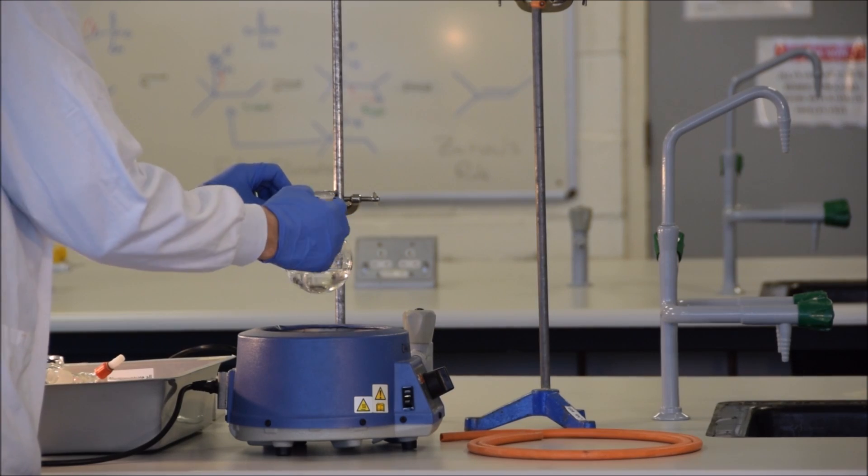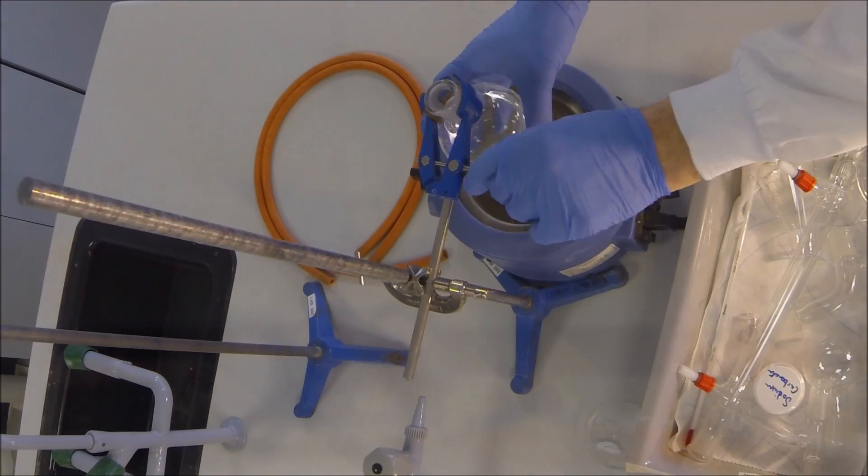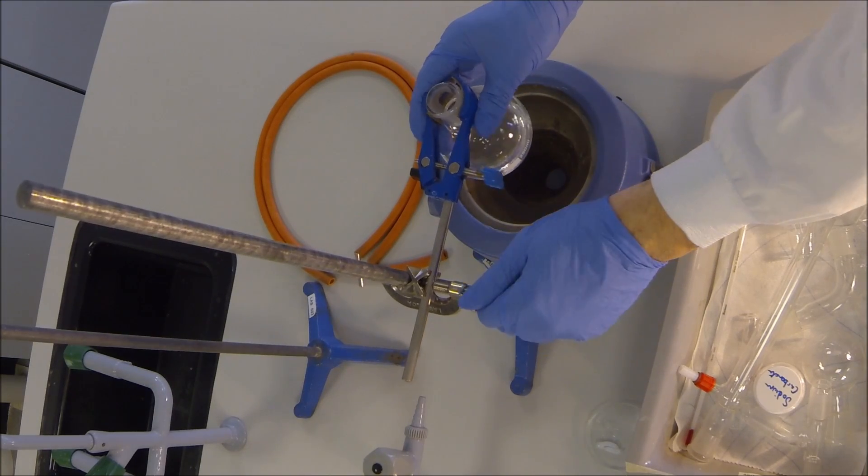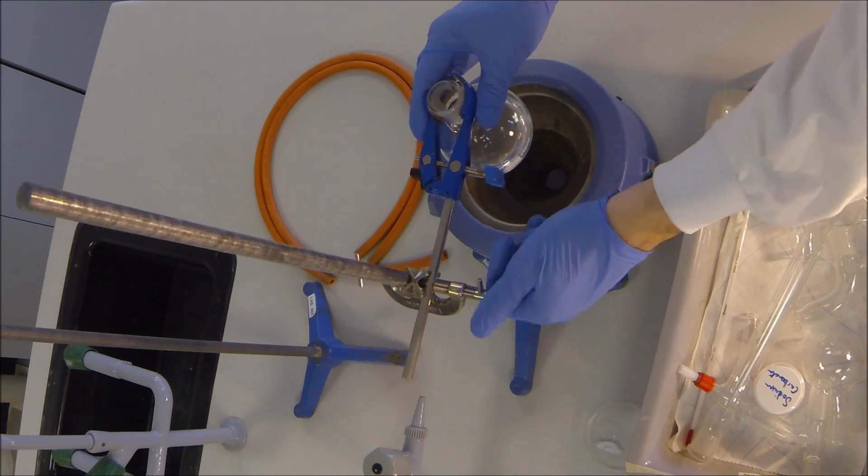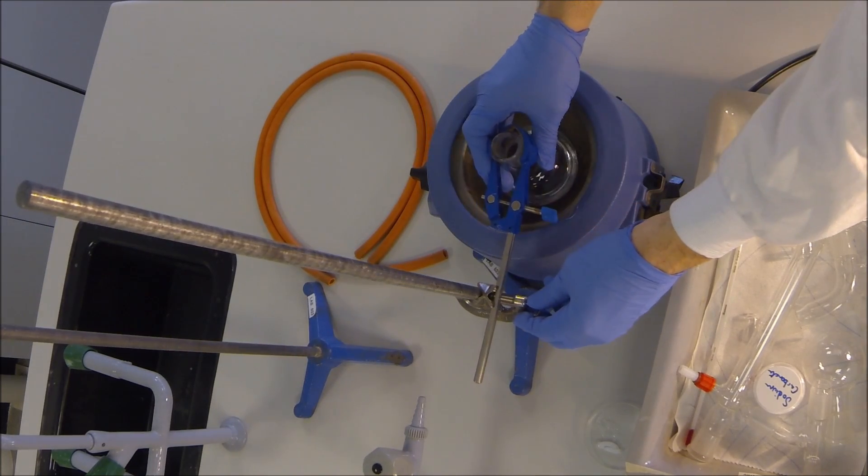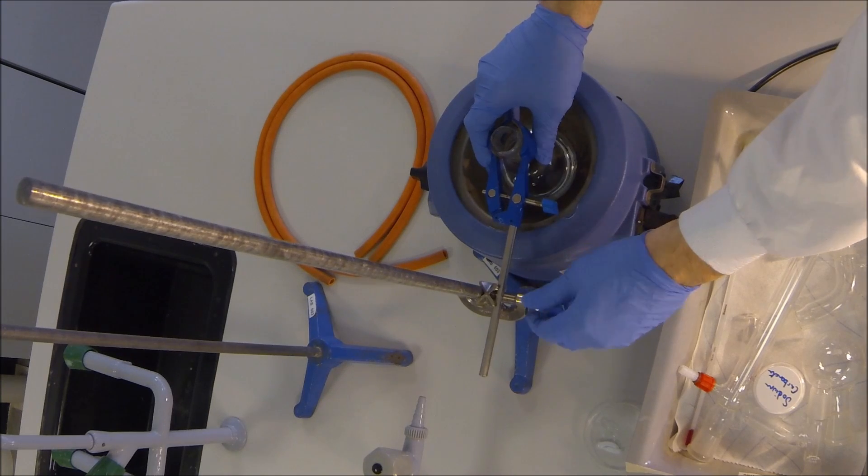The reaction mixture has been cooled in ice to ensure that it does not start reacting prematurely. So, the first thing we're going to do is make sure that it is securely held by the retort stand. Affix the clamp around the neck of the flask, ensuring that it is secure, and then lower it into position.